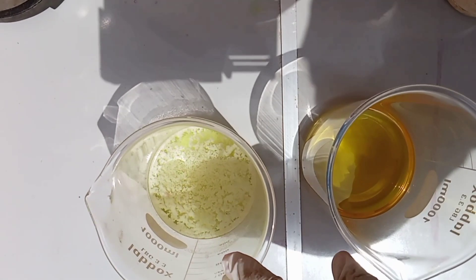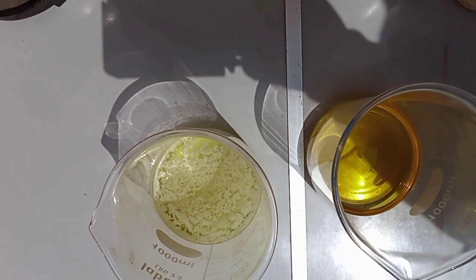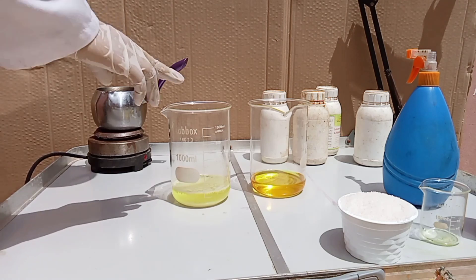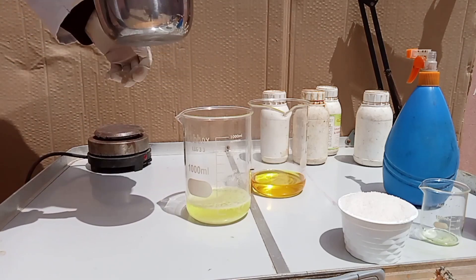All we need to solve this problem is to add warm water to the beaker.